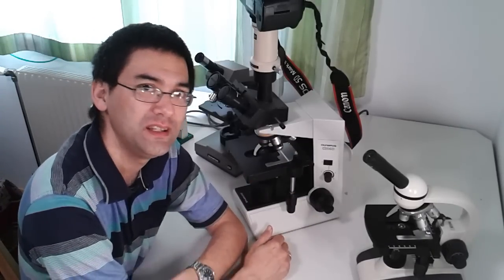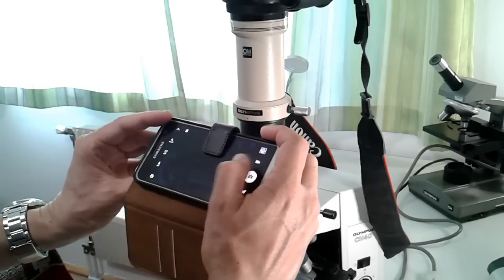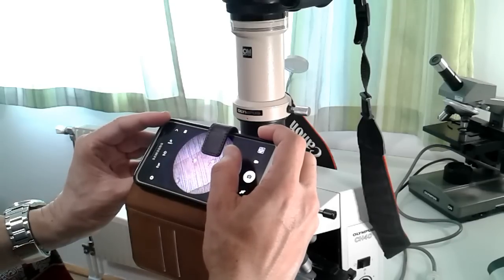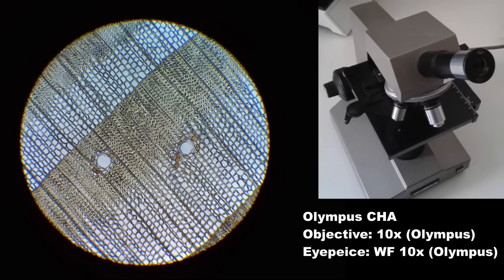Later, if you want to try different optics and contrasting techniques, you can always buy a better microscope — and by then you'll have the experience to make an informed decision. Now for the image comparison: you need a very steady hand to take pictures with your mobile phone. The distance and angle have to be correct. I did have to try several times. This is spruce wood at 100x magnification, taken with the mobile phone directly through the eyepiece.